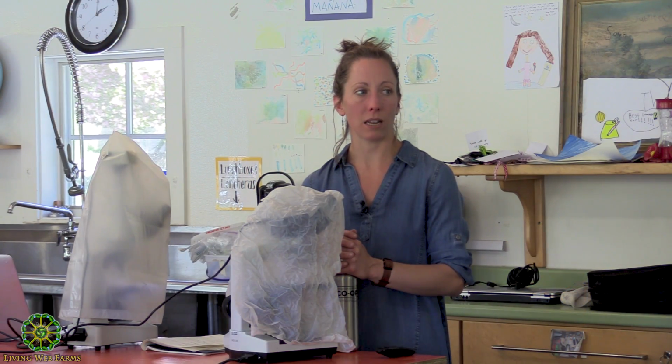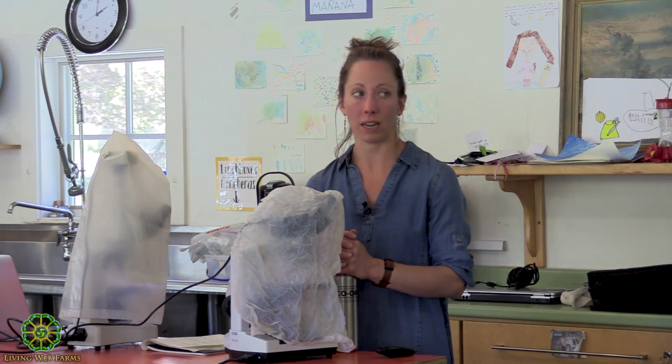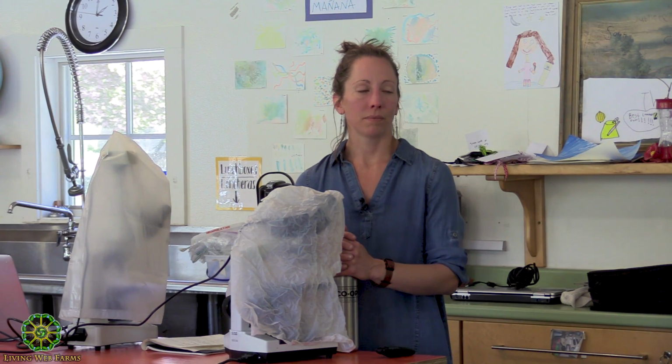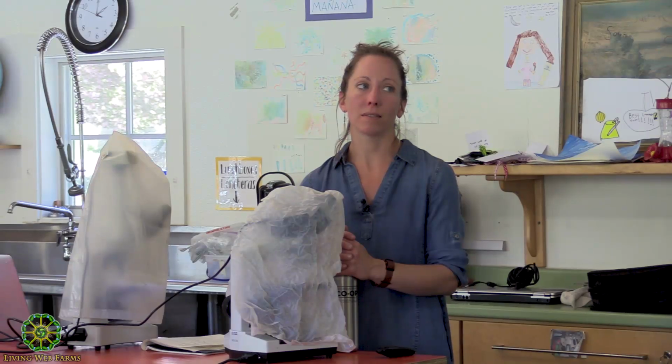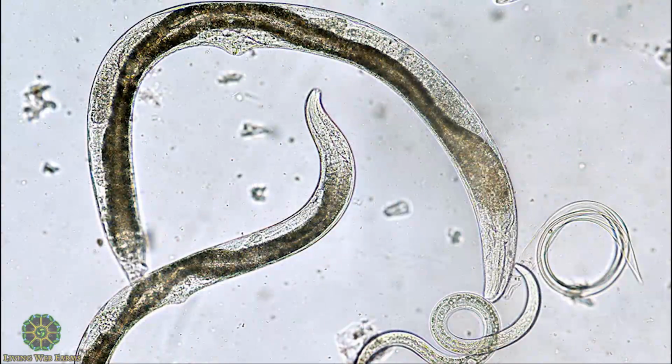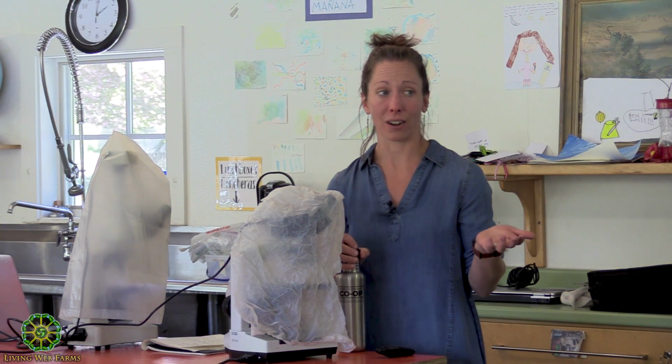Then we have ones that eat fungi, and then we have ones that eat each other, and then we have some that spear our plant roots and kill them. If you want to get rid of the ones that spear the plant roots, you have to have the ones that eat other nematodes, right? See what I'm saying? So we need a good balance. In general, it's a higher taxonomic group. So in highly disturbed soils, you're not going to find hardly any nematodes at all, and definitely not fungal feeders.